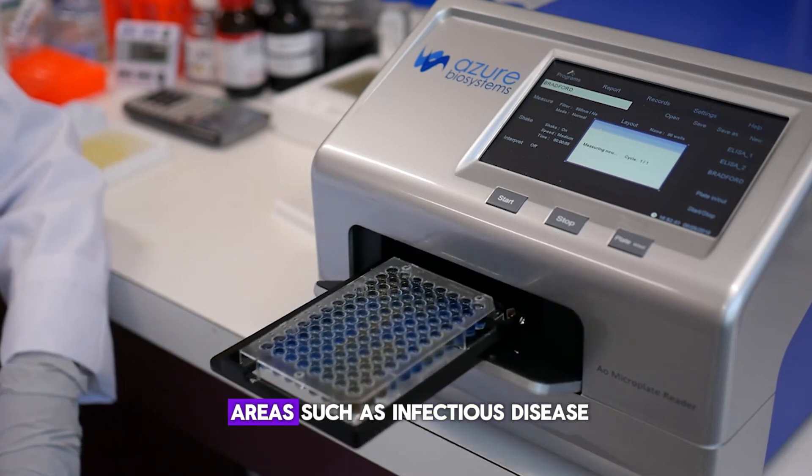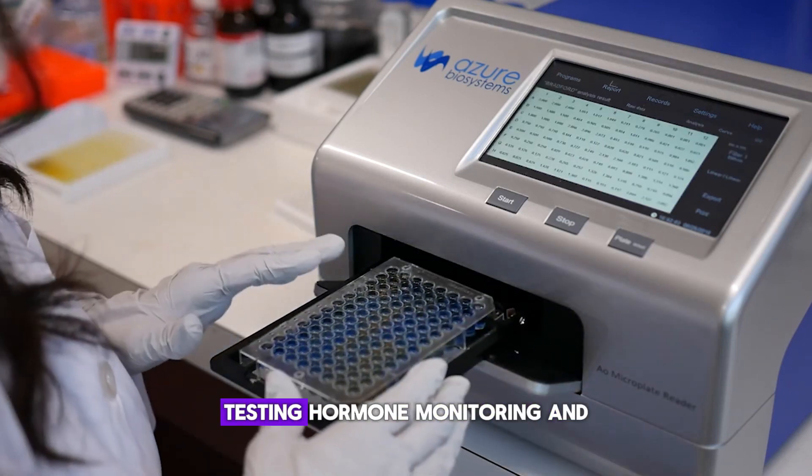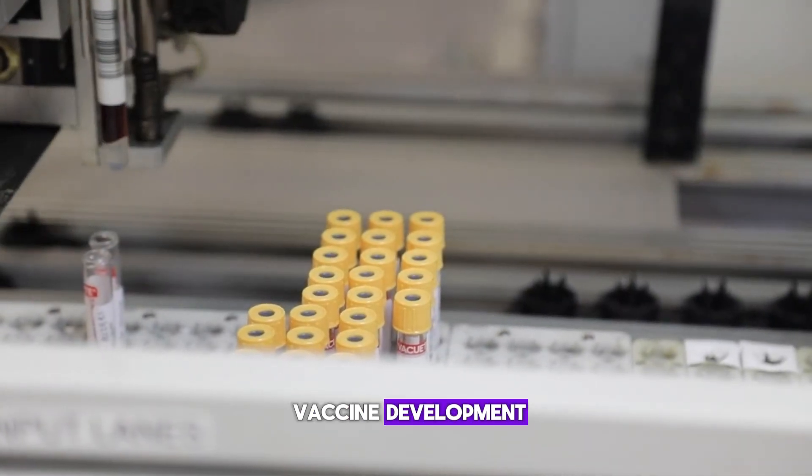It's widely used in areas such as infectious disease testing, hormone monitoring, and vaccine development.